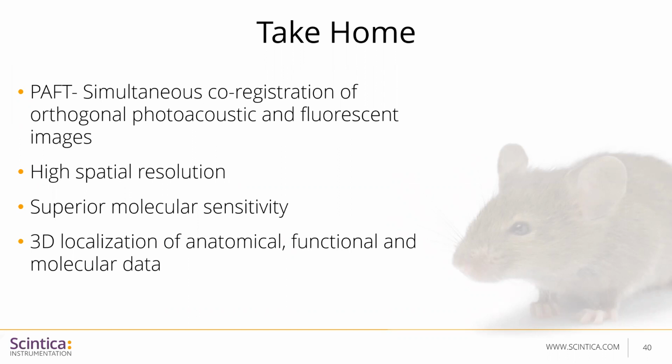Three-dimensional visualization of optically labeled biological structures is also possible, and the resolution is around 100 to 150 microns. So this instrument benefits from the exceptional molecular sensitivity, which comes from the fluorescence tomography, and the photoacoustic tomography enables functional imaging with high spatial resolution. This helps the PAFT system be used for 3D localization of anatomical, functional, and molecular data.